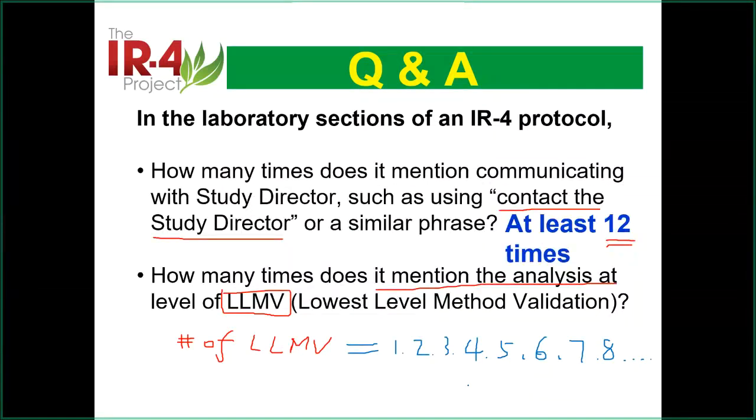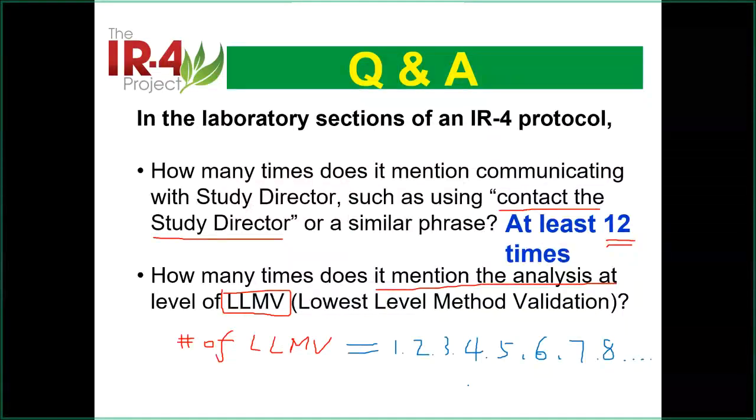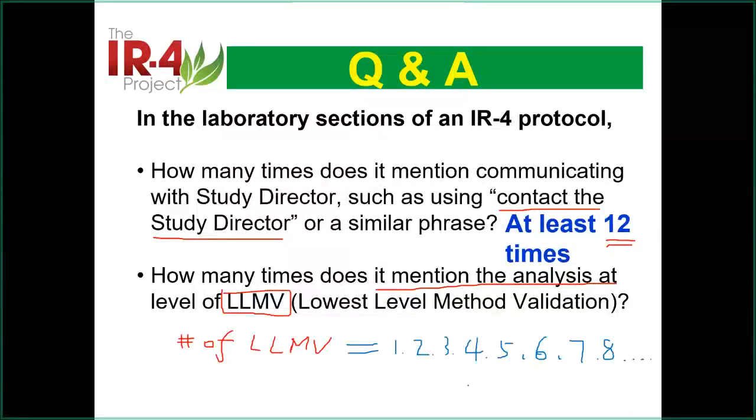Okay. And also, most likely for every instrument, they do annual calibration, annual maintenance. That's called the routine because the service engineer will come every year to fix the machine, not necessarily fix, but to make sure it's working. It's because the machine is drifting away from the standard point. So that's called the routine.